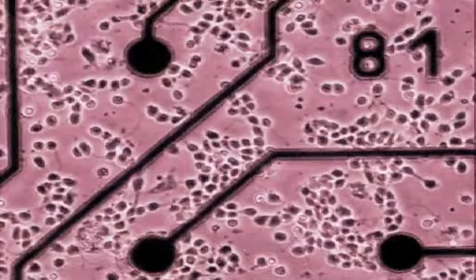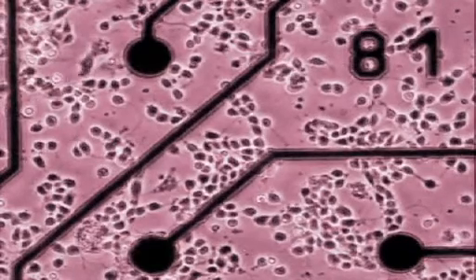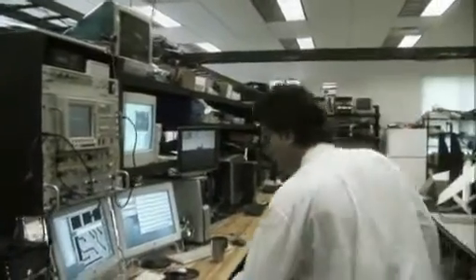We can also stimulate activity within that network. We can send in different patterns of stimulation and look at how the network changes as a result of those stimulations. That's how we do what we do.